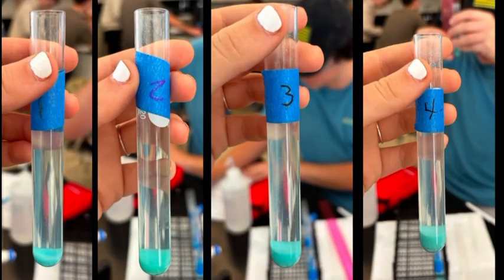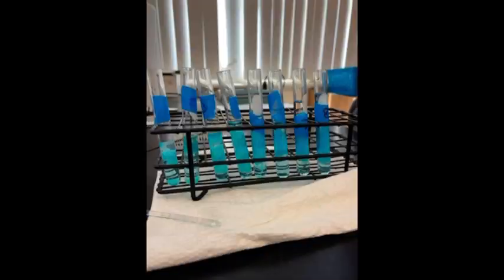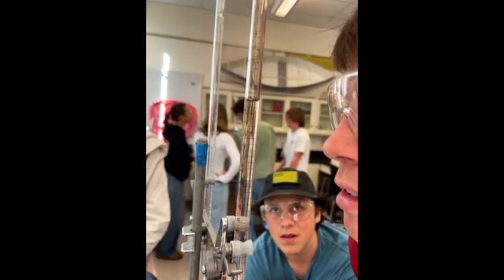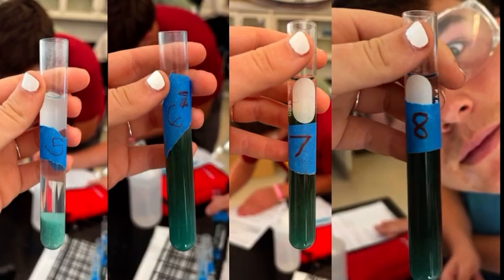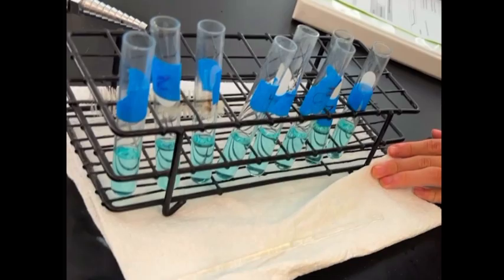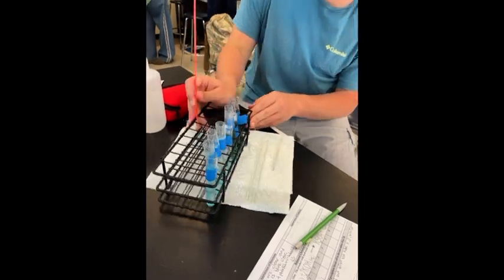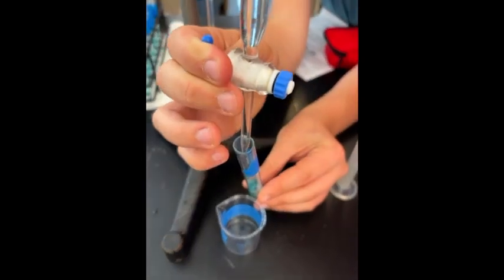In test tubes 1 through 4, we say that the limiting reactant is KOH because if we look at what we added to each test tube, we had an increasing amount of KOH while the amount of CuSO4 stayed the same. This is telling us that KOH is controlling how much product is being produced. In test tubes 5 through 8, the limiting reactant is now CuSO4 because each test tube had 5 milliliters of it, causing the precipitate yield to stay relatively the same. There can be several sources of error in this reaction, including transfer error and measurement error.